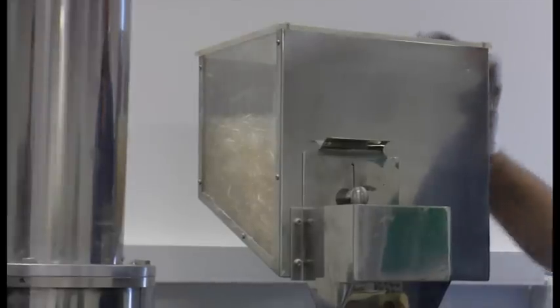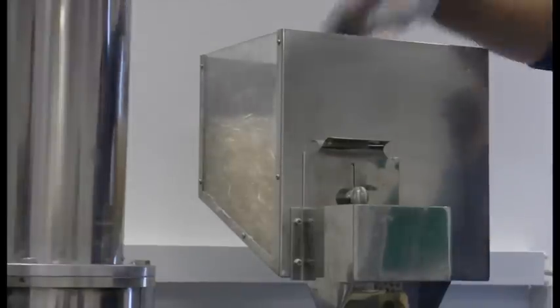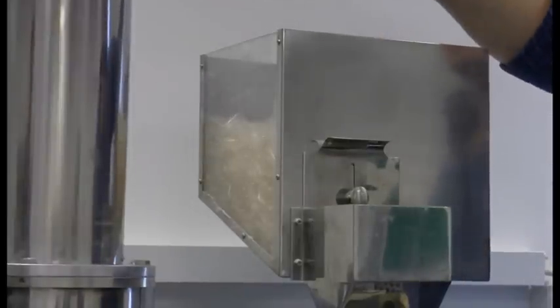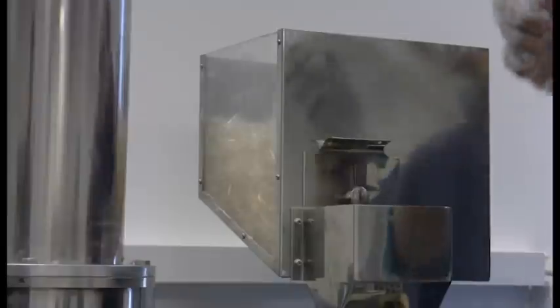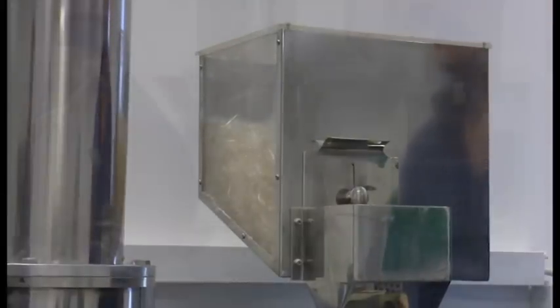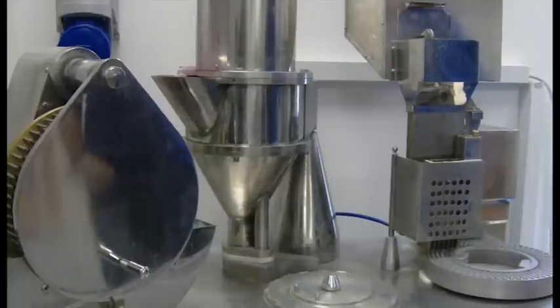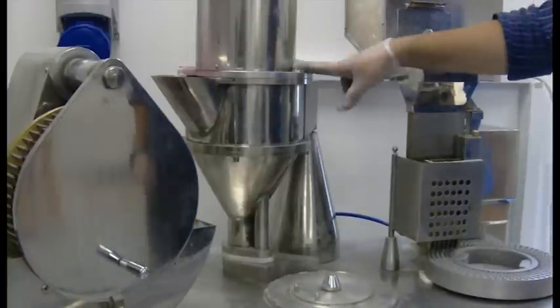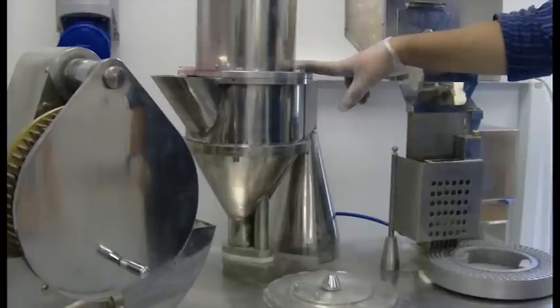The capsule filler has a very simple setup. The capsules are loaded into one hopper. This hopper can take any size from 00 to 5. The powders are then loaded into a separate hopper. This is a corkscrew driven hopper which allows a constant fill throughout each capsule.